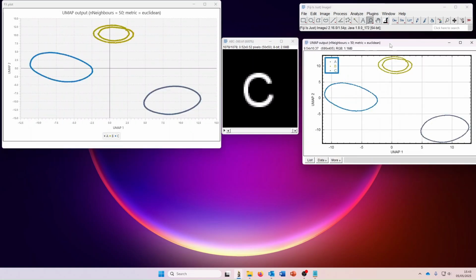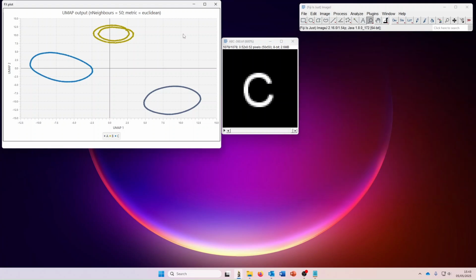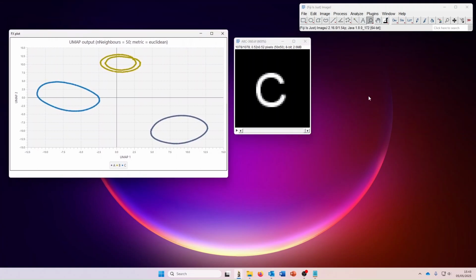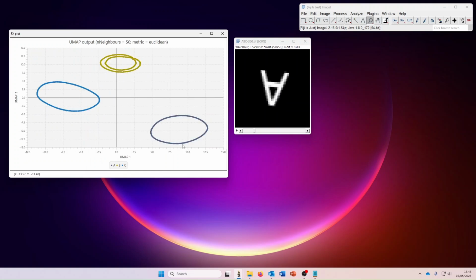Okay, so here you go. Again, the original ImageJ plot, which we can choose to use if we want, but the interactive plot is the one we'll focus on for the moment, because this engenders many of the new changes in the DimRed plugin's version 1.06. So here, as before, we can highlight the different points. We can zoom in with the mouse wheel, double click the plot window to go back to the original zoom. Obviously toggle the states as before.